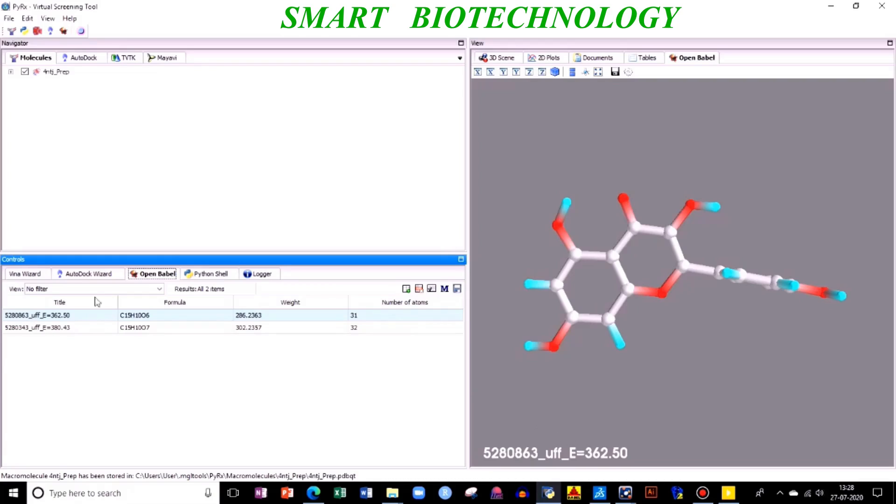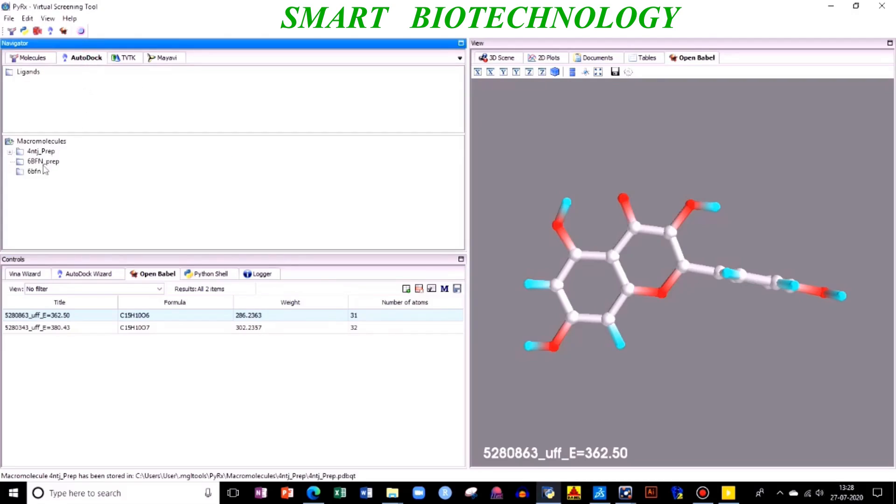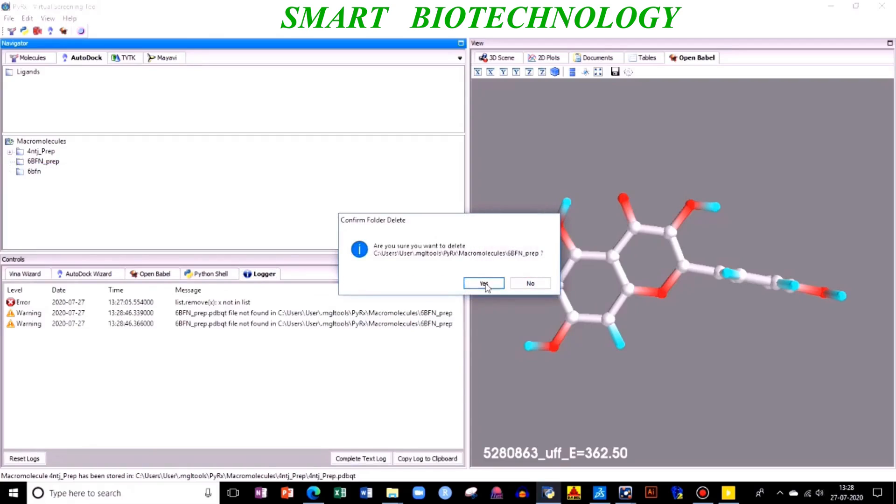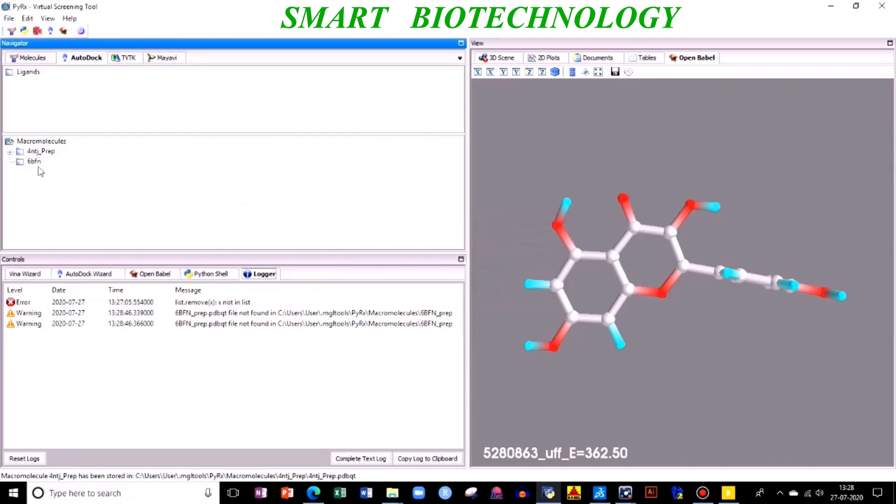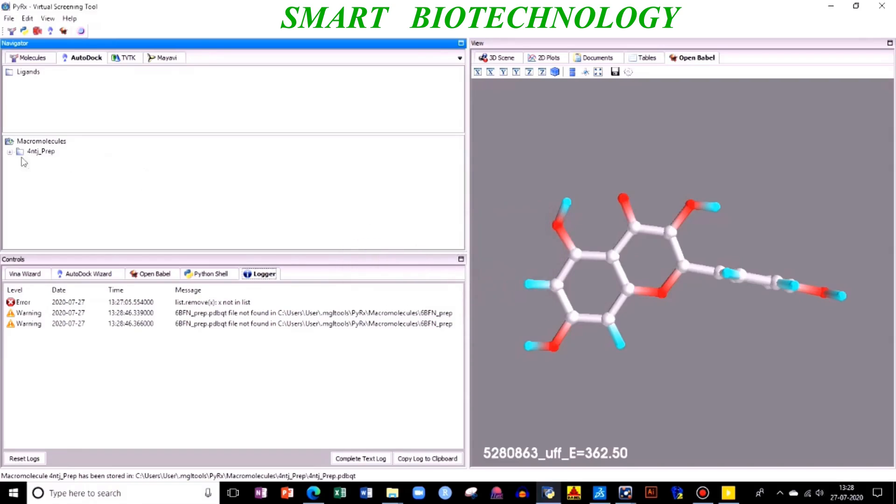Before that, when you have done make AutoDock macromolecule, your hydrogen bonds were added. When you go to your AutoDock, you can see your macromolecule. This was your previous thing, I'll delete this or you will get confused. When you do your make macromolecule, you can see your PDBQT file.